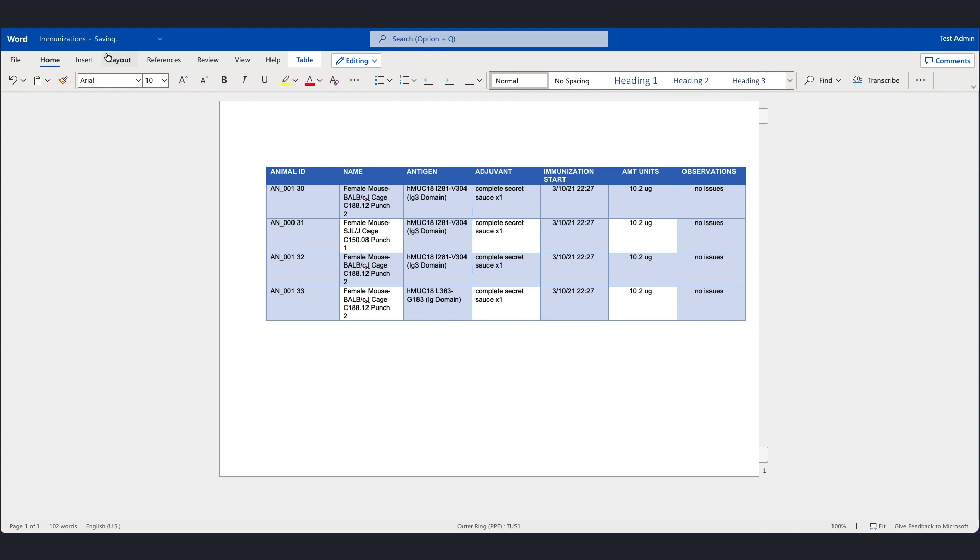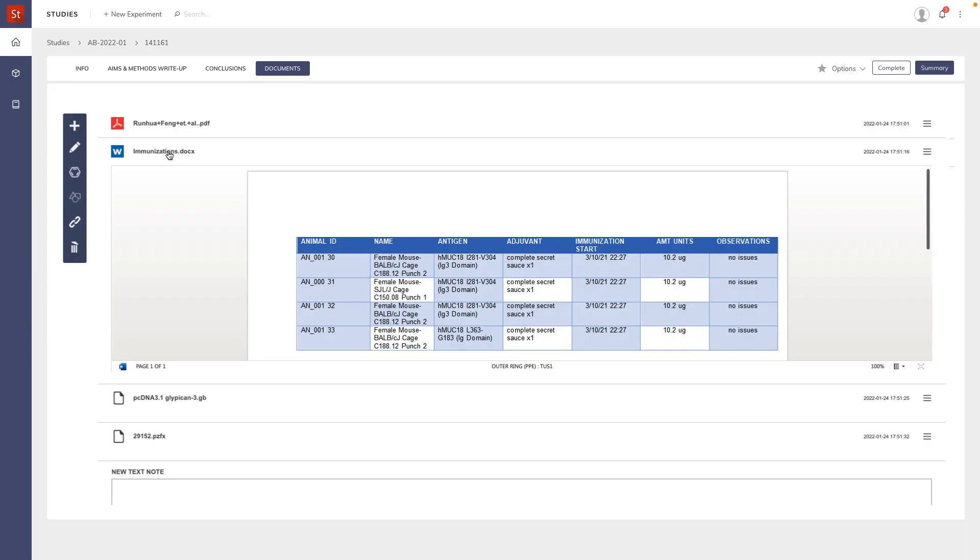So I simply make the changes necessary and then close the document. The ELN is automatically updated.